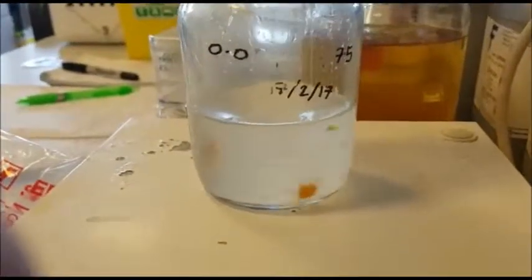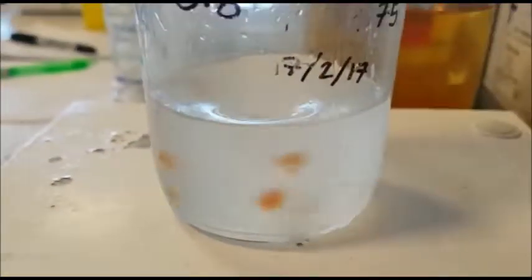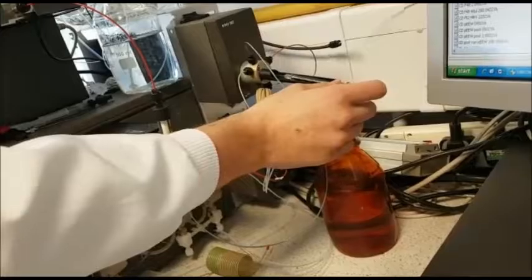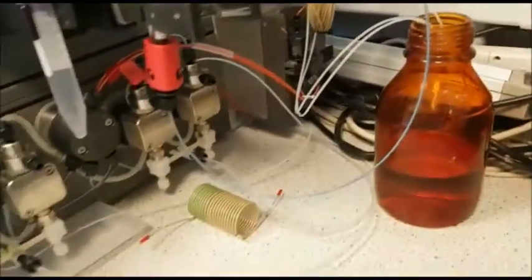Platelet activation is one of the effects of the venom in vipers. The purpose of my project was to analyse the effect of phospholipase A2 and snaclec on platelet activation. In order to do this, I had to purify the two proteins.